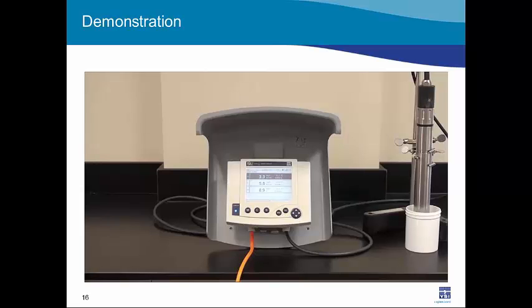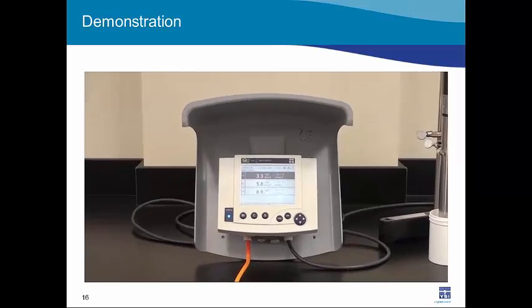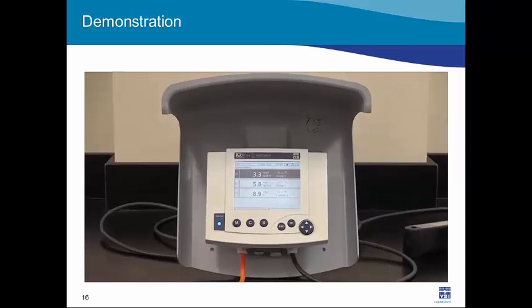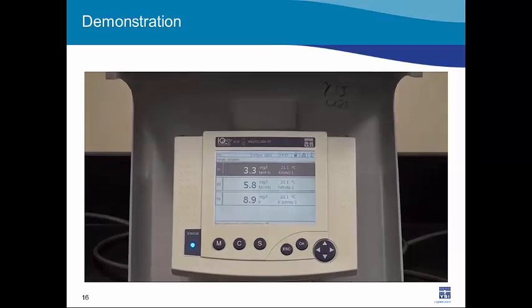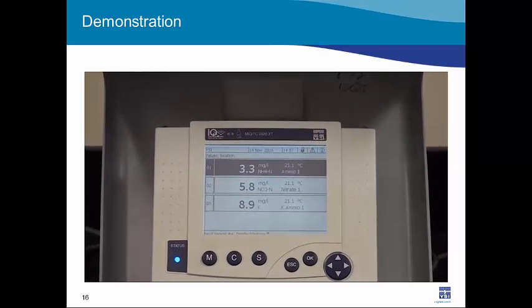I have another video here where I demonstrated doing the matrix adjustment in an IQ SensorNet system. So I set this up in our lab. Basically, a Varion probe is sitting off to the right there in a vial of sample, and is connected into the 2020 XT. As we zoom into the screen right here, we can see the ammonium, nitrate, and also I've chosen to display the potassium measurement. There is no chloride electrode on this probe, so those are the three electrodes that are hooked up.